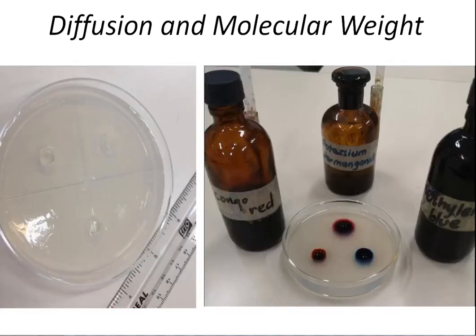Now let's have another experiment demonstrating the relationship between rate of diffusion and molecular weight. Here we have a Petri dish, and we filled it up with agar. In the agar, we bored 3 equidistant holes, and in each of these holes we will be placing 3 different reagents.